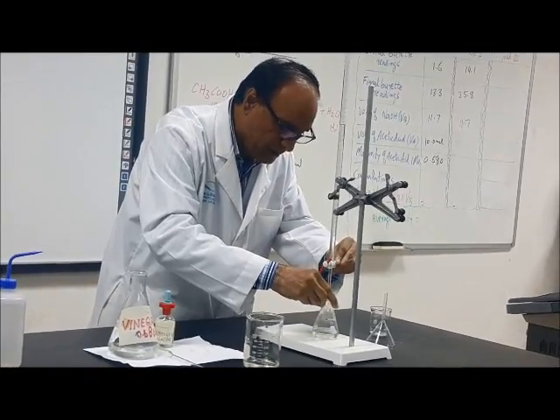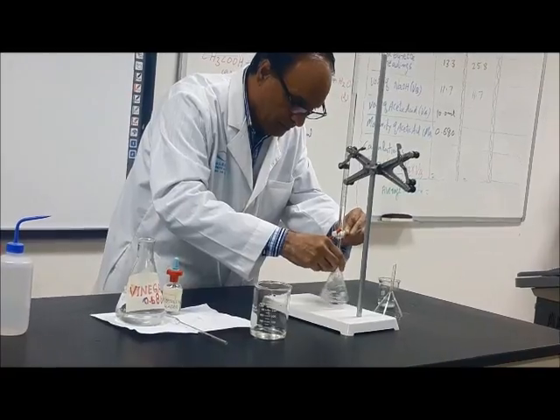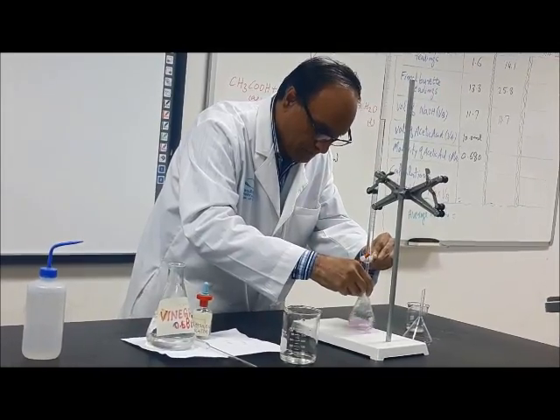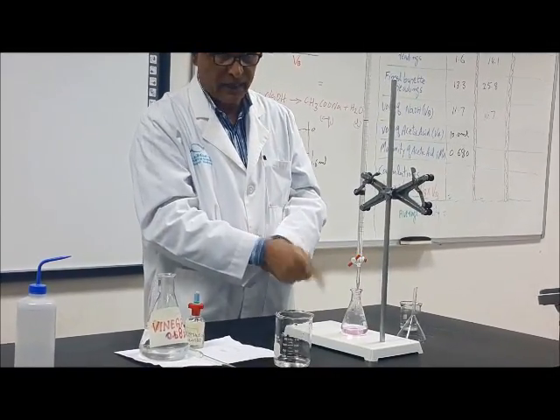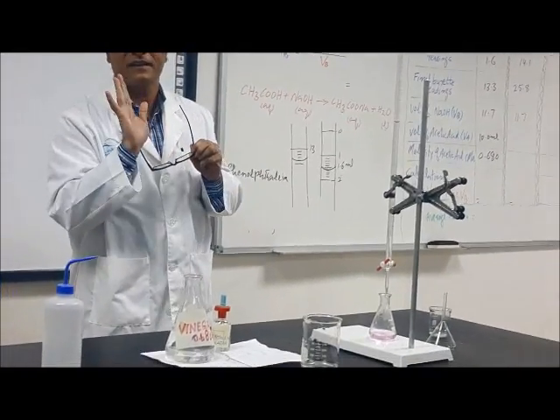Can you guess how many drops I need? 3 to 2. Maybe 5. 4. One more time. One more. I think, next one. No. One more time. That's the best endpoint. But I put one more. That's the endpoint. I know that the color is changed, and this is permanent. Everybody can see. This is the best color.